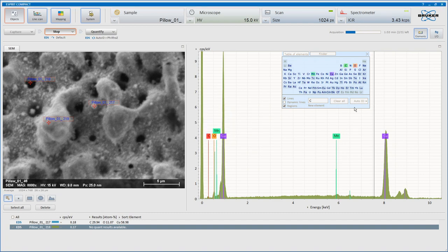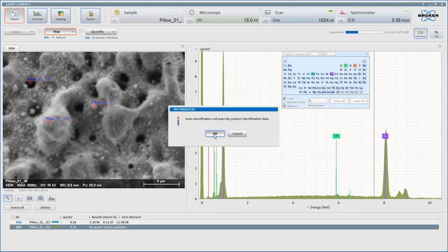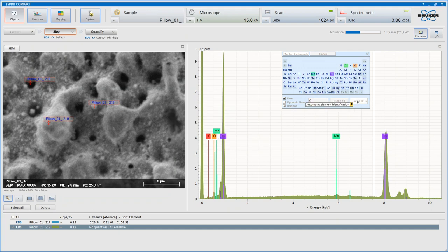So it seems to find a little bit of manganese on this, but it might be misguessing it. But it's possible. Really is thinking it's seeing that. I don't see that other beam there, so I'm going to turn that off. There is a slight peak here, but I'm not sure that's manganese because we don't see that second peak down there.